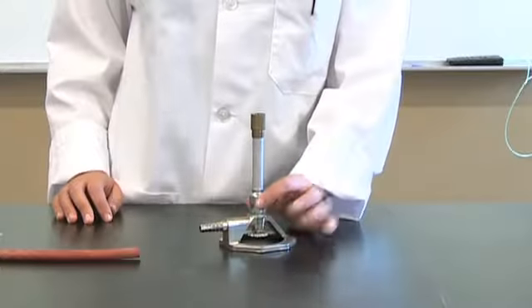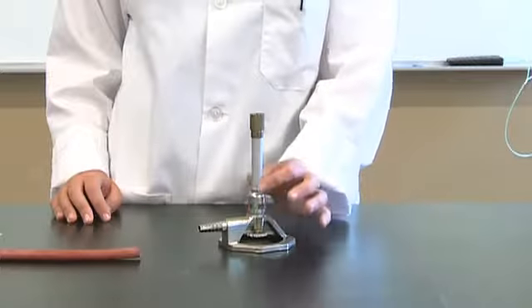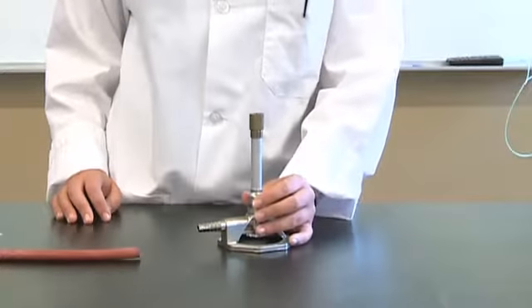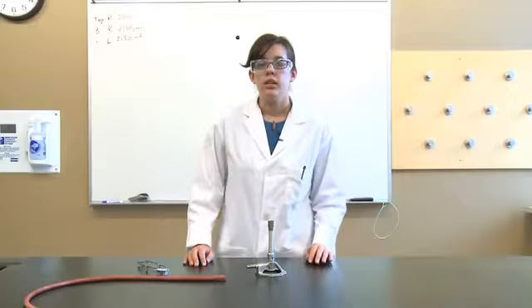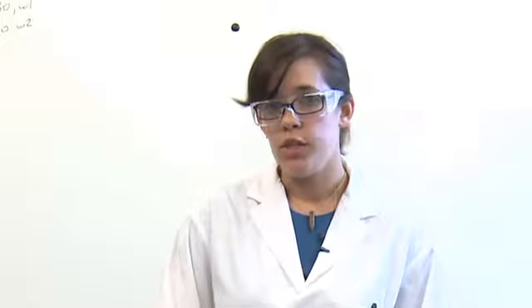When handling the barrel of the Bunsen burner, it's important to hold it at the bottom. When the flame is lit, it can get very hot any higher up, so doing this regularly will help you to remember to do it. You should never leave your Bunsen burner unattended when it's lit. You should make sure you're aware of where all emergency exits and emergency gas shutoffs are, as well as all safety equipment, before you begin using your Bunsen burner.